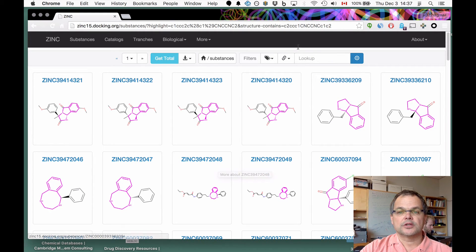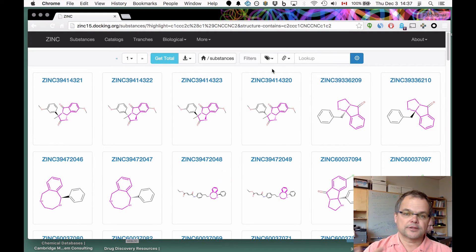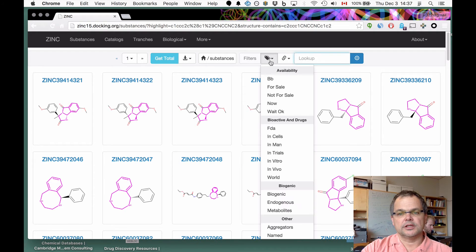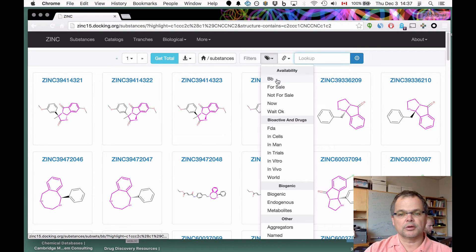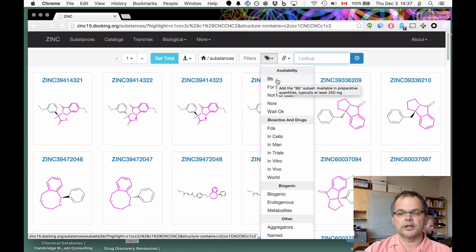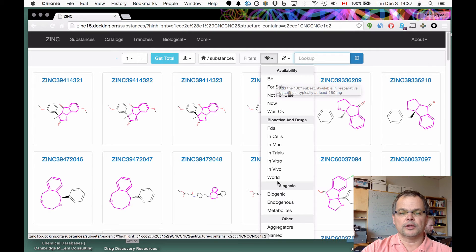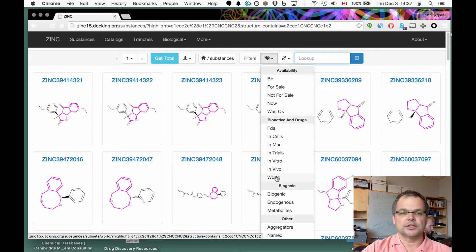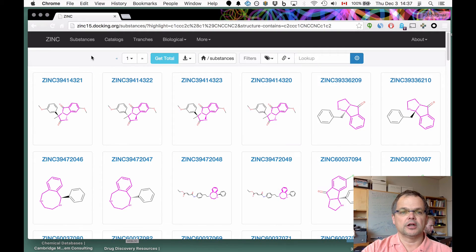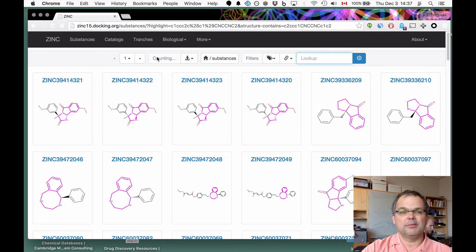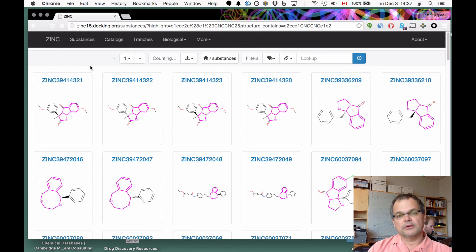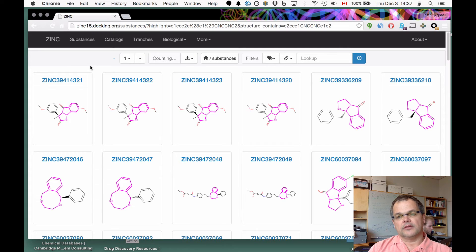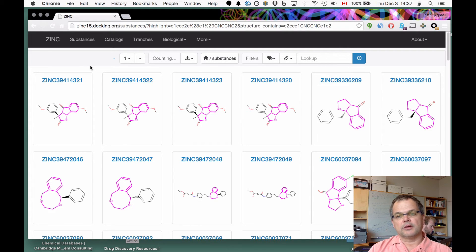Again, you can ask which of these is commercially available, which is available in building block quantities, which one is a world drug, and so on, or simply ask how many of these compounds are there. If you do counting, it's going to run the query and give us a count of the number of molecules so we know how many there are.